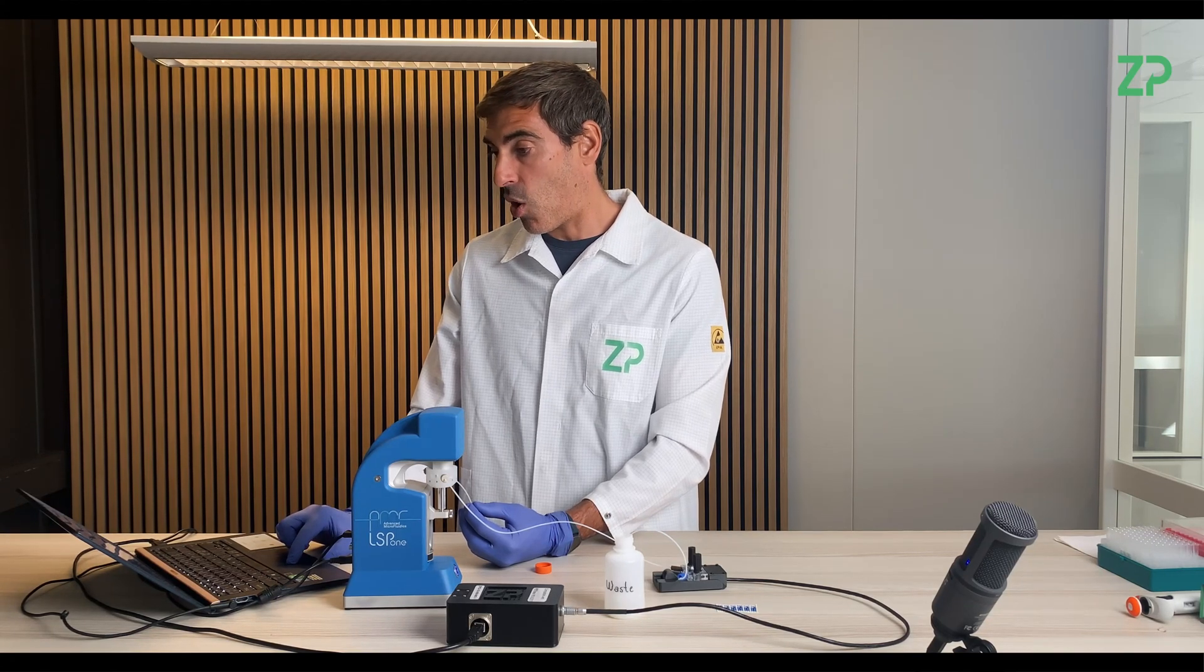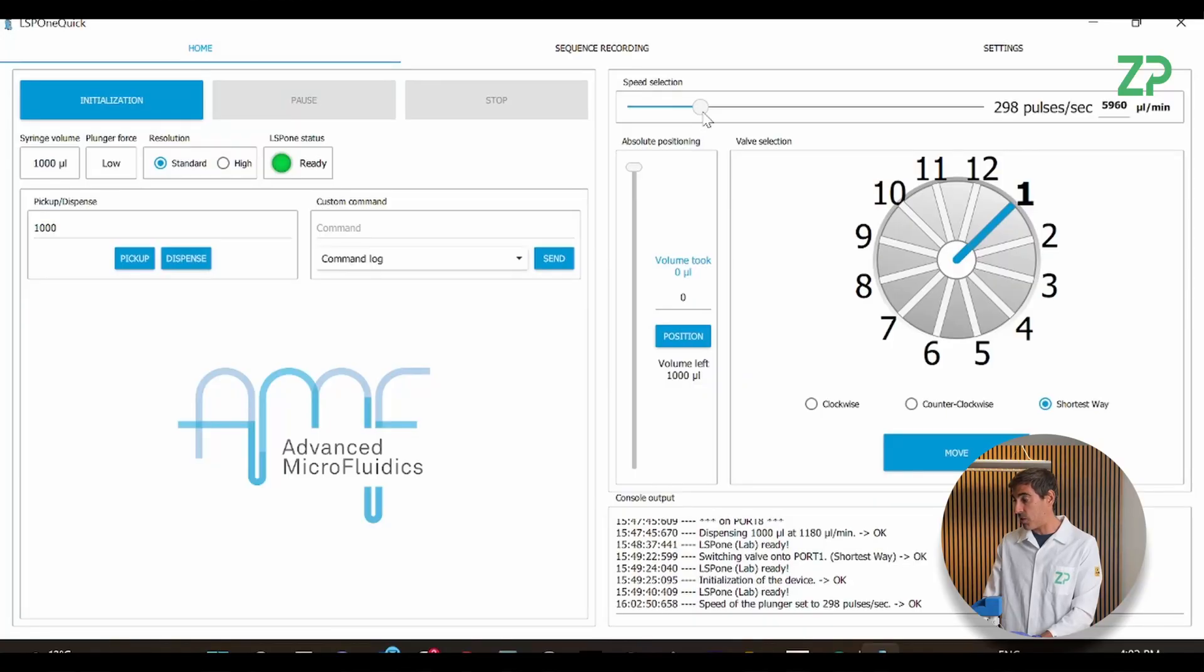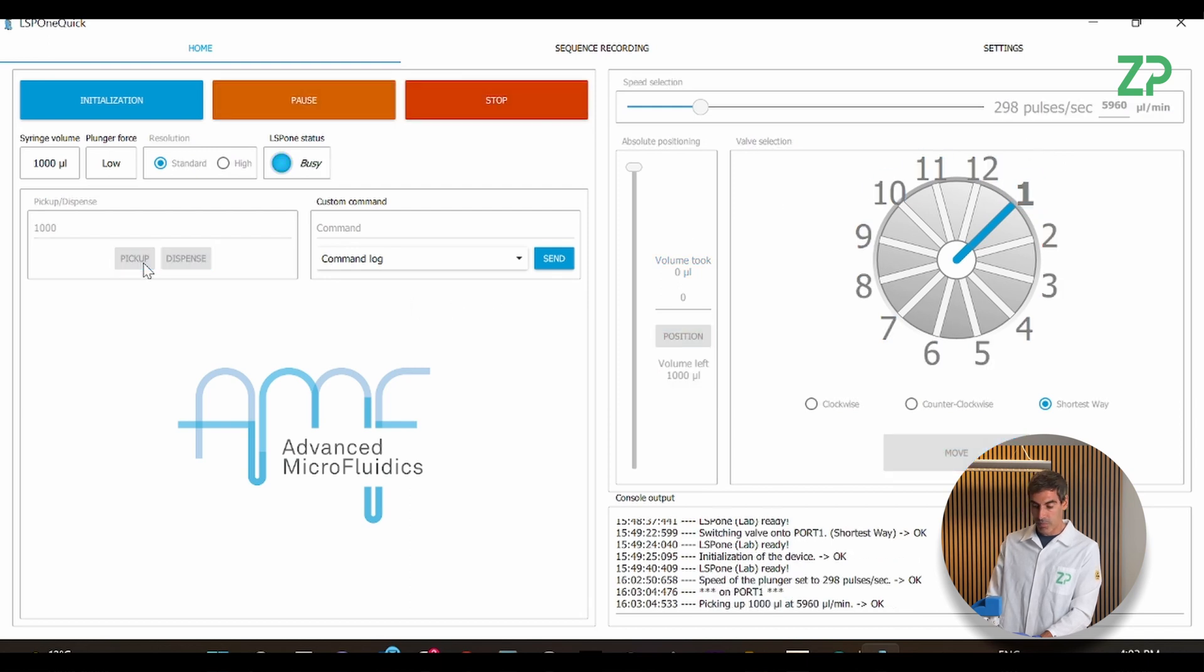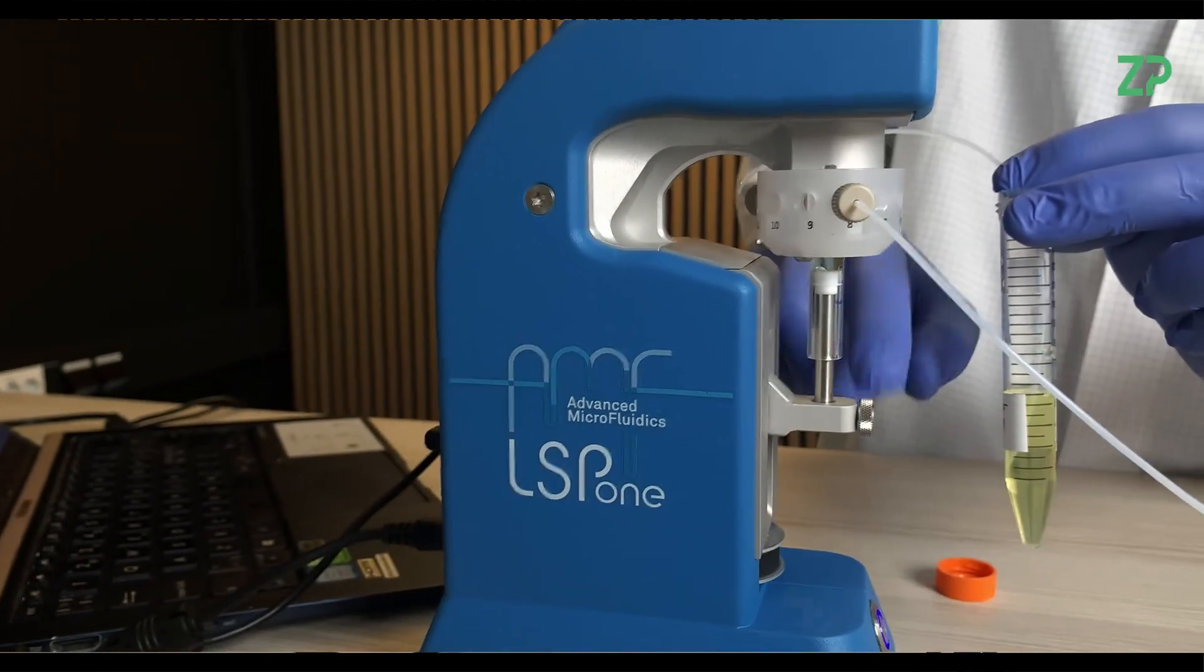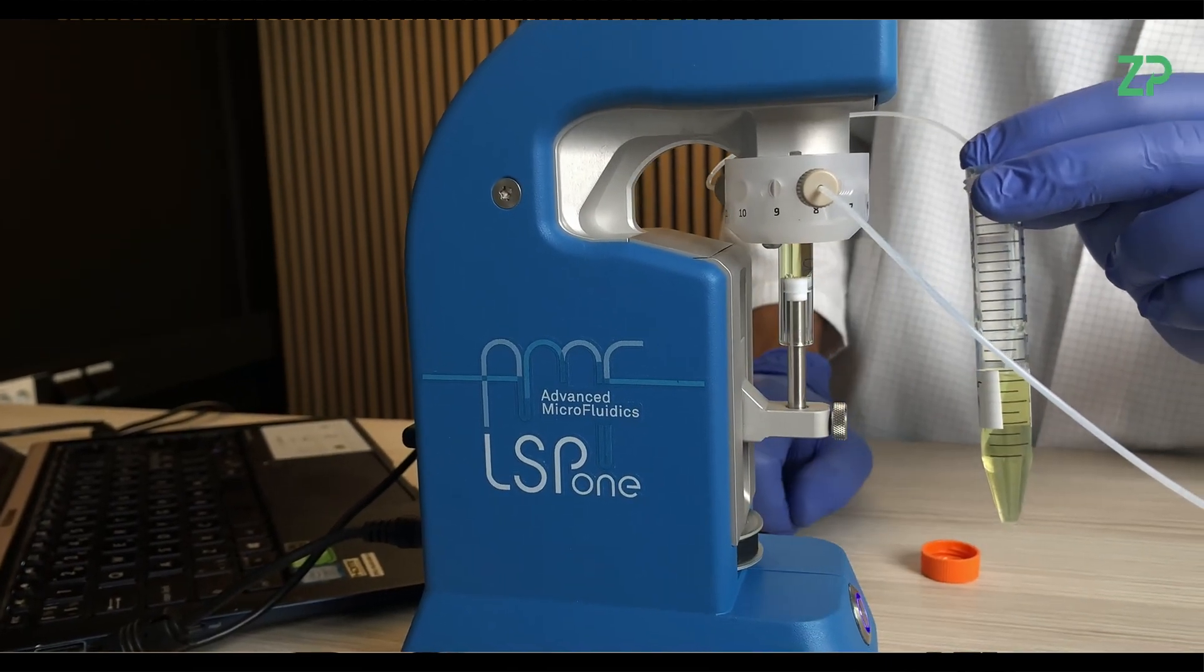And now I am on the software for the pump, but this could also be a script in Python. I'm going to select from channel 1. I'm going to select to pick up at a relatively high speed, so 298 pulses per second. I'm going to pick up one milliliter. So now you see the syringe is filling with the solution.